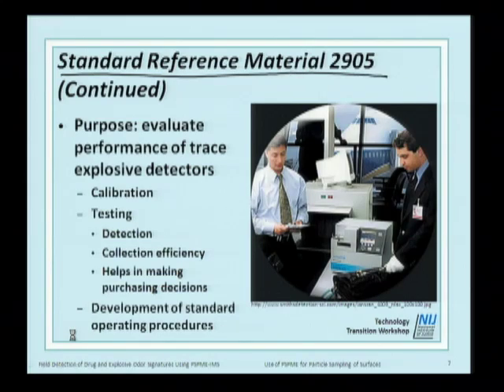So the reason why this standard reference material, 2905, was created was to evaluate the performance of these TEDs, these trace explosive detectors, for calibration, detection, collection efficiency, and allowing people to make purchasing decisions looking at a standard reference material, doing the same thing with the same material with a lot of different instruments, as well as developing standard operating procedures for collecting particles.